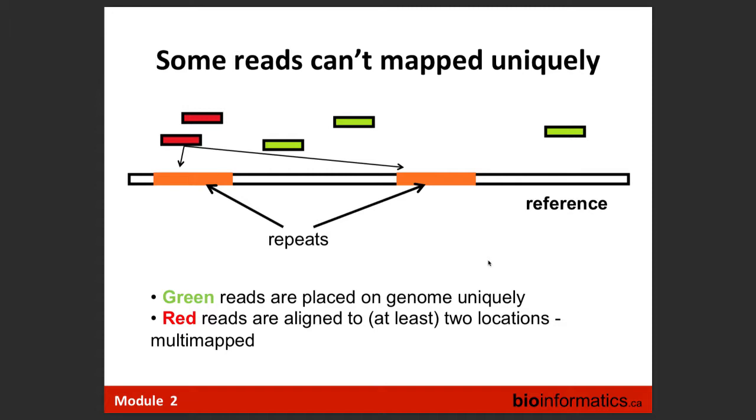However, it kind of randomly tells us those. So if there are 10 positions where the read can be aligned, it just randomly gives us 3. It doesn't give us all. There is an option where we can report all of them, but the order of the positions also is random. So it's a little bit tricky.